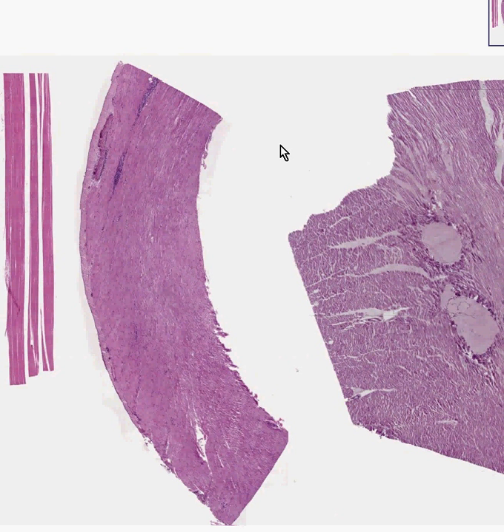There are three kinds of muscle histologically. There is muscle without striations, so that's called smooth muscle. There are two types of muscle with striations, and if the fibers are arranged parallel, that's called skeletal or voluntary striated muscle. If the striated muscle has fibers which connect with each other as a mesh, that's called cardiac muscle. In this field, we have all three kinds of muscle.